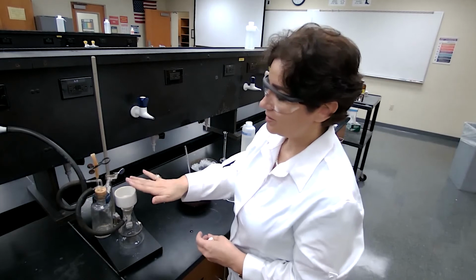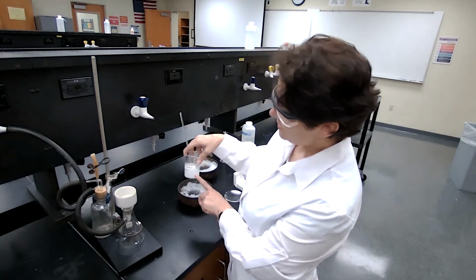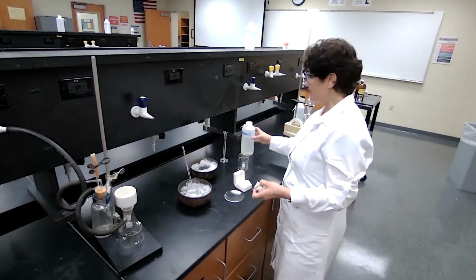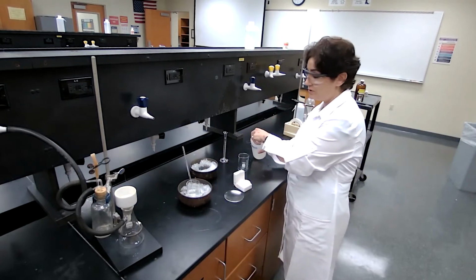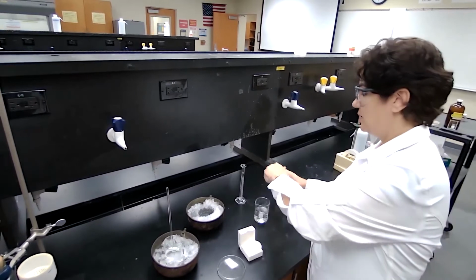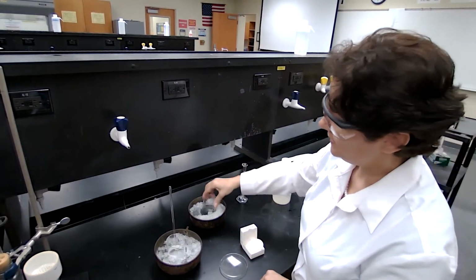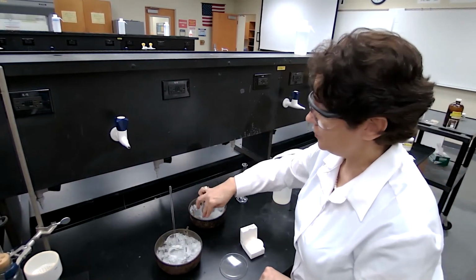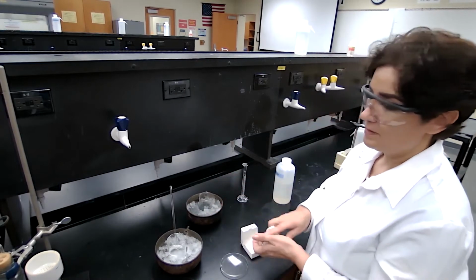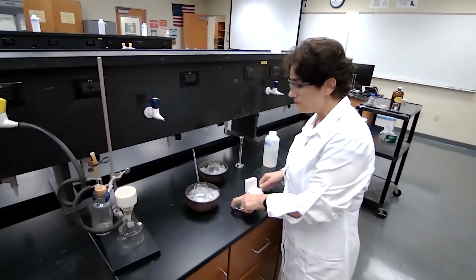When you are keeping the solid, you want to force the liquid to be removed as much as possible. And then you want to wash the crystals with cold solvent of what you have in this mixture. Because this was an acid-base reaction and the solution is aqueous, we have water as the solvent. I'm going to prepare some ice water, placing the cold water in ice to have it ready for when I'm about to wash the crystals.